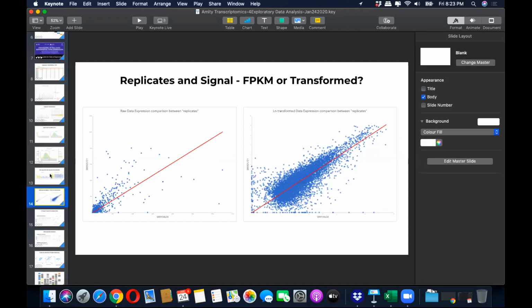So we tested these assumptions by plotting this data. If I plot all the TN triple negative samples in the same plot, plotting all of the gene expression in the same scatter plot, you can see that if the samples are identical, as I was telling you before, their level of expression should be aligned perfectly along the diagonal red line, as you can see here. So if they are correlated, the values should be stretched out along this line, properly in a single line.